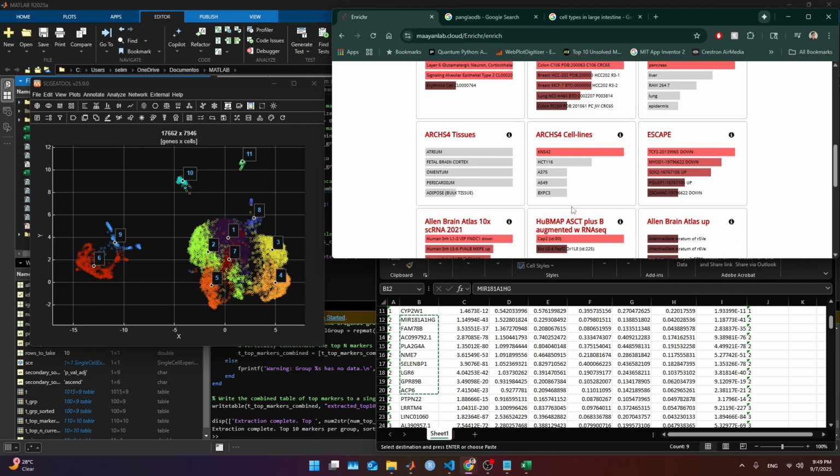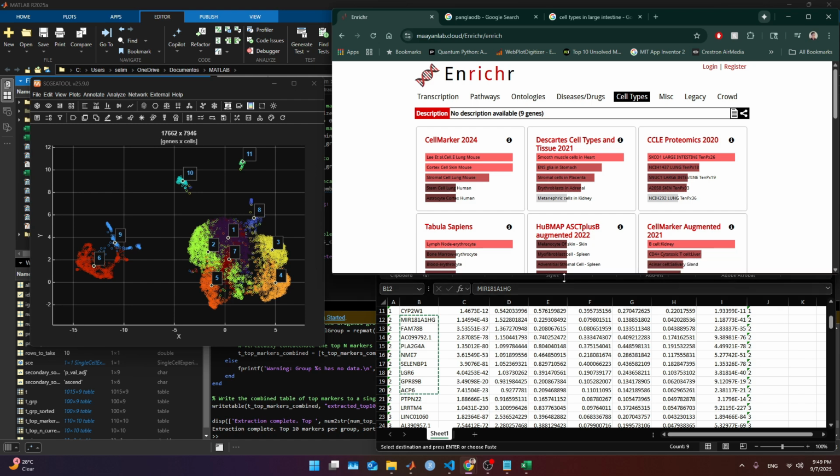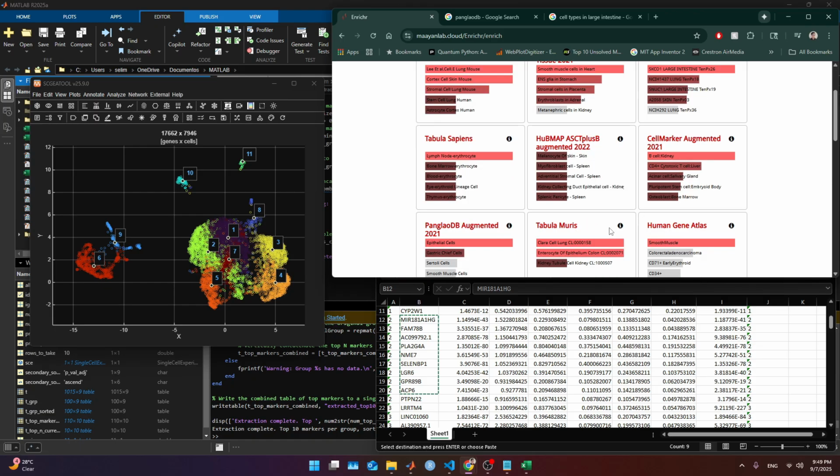Colon tissue. It's too low. We usually have to look only at the top. Cortex, stromal cell, lung mouse is not that. Stem cell, lung human. It's not that far. This is telling large intestine. We're gonna look for whether it is epithelial or not. So it's telling us that it's potentially something else.